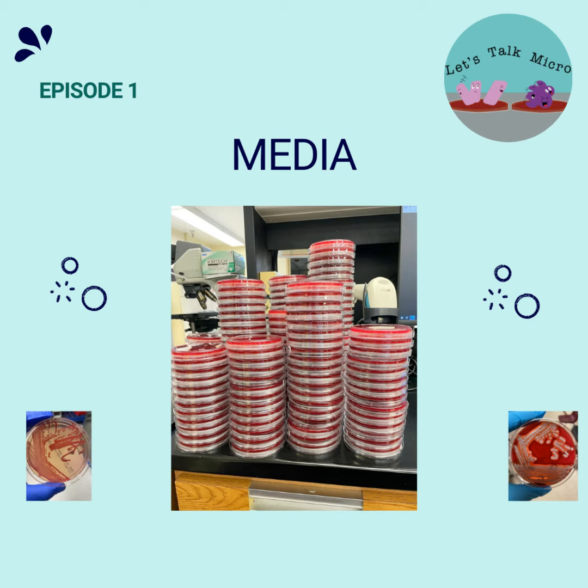So alpha hemolysis is the partial lysis of the red blood cells in the agar, right? So it gives you a green color, greenish. Beta is complete lysis, so it makes the agar look clear. And then you have gamma, which is no hemolysis, so it stays the same. And another example is MacConkey, and it's differential for lactose fermentation. So organisms that ferment lactose, right, they turn pink.